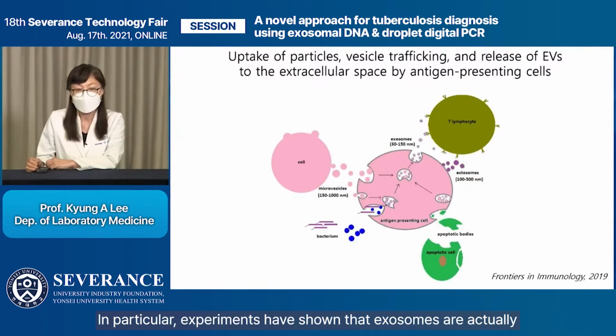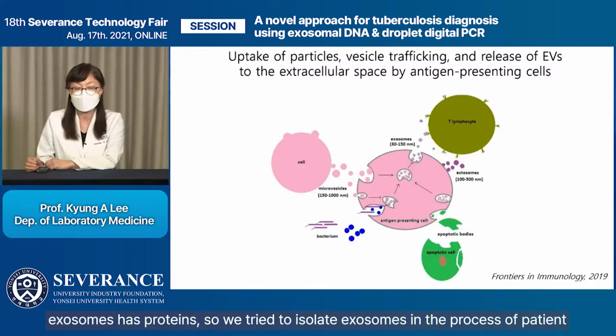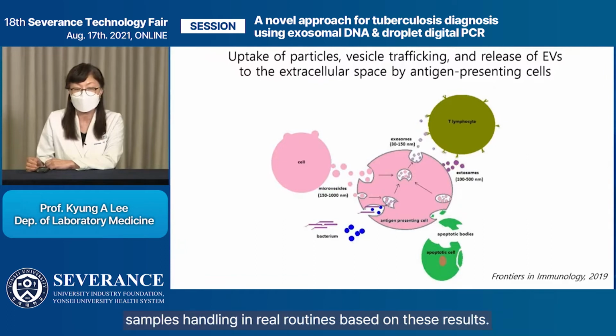In particular, experiments have shown that exosomes are actually isolated from the MTB-infected animal model, the mouse model, and that TB inside exosomes has proteins. So we tried to isolate exosomes in the process of patient sample handling in real routines based on these results.